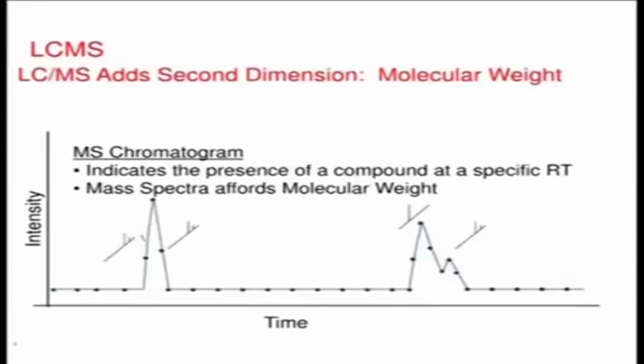In that case, you can use an MS as one of the detectors. With MS, what information are you getting? Not only the retention time, but also the mass spectra, like mass to charge ratio, for confirmation. There is also a possibility that 2 or more compounds eluted at the same retention time may have the same molecular weight. How can you confirm that the peak eluted at this retention time is pure or not?